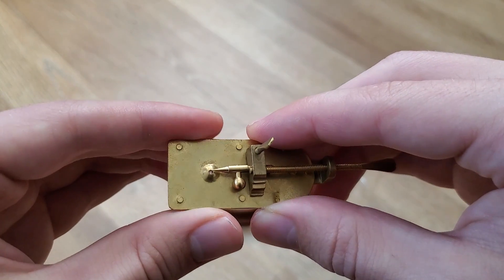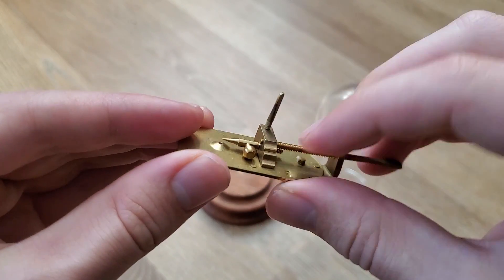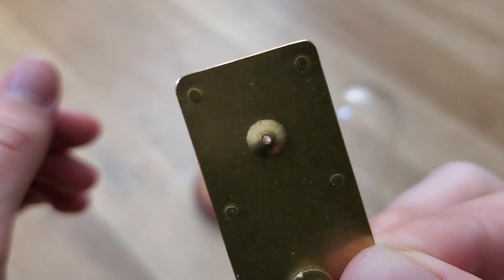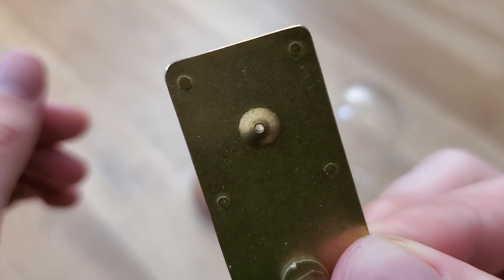And once your sample is properly positioned over the lens, you can take it, rotate around, put the eyepiece to your eye, and view the microscopic images behind.